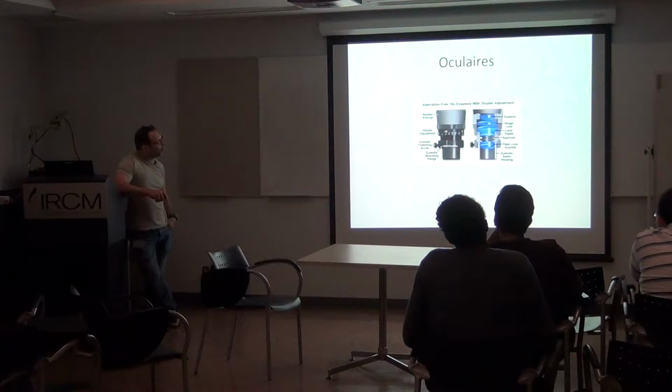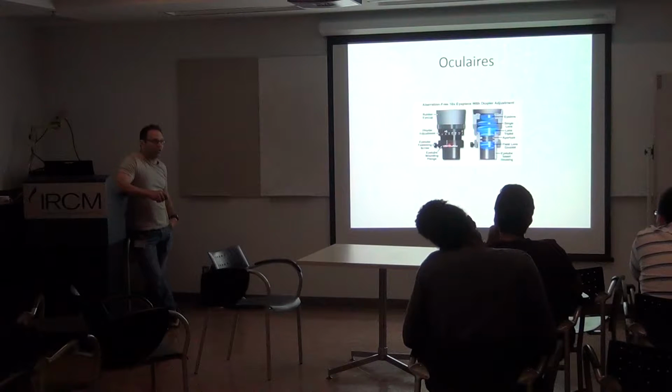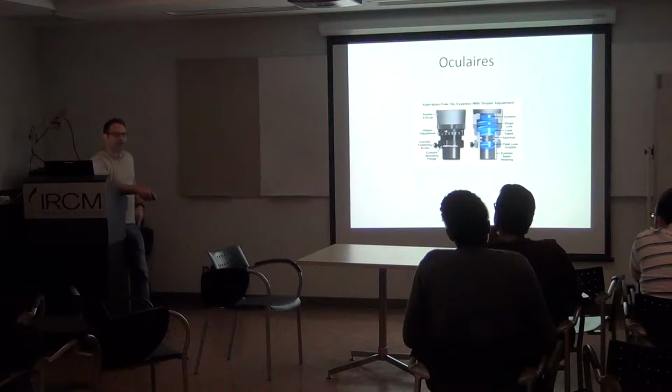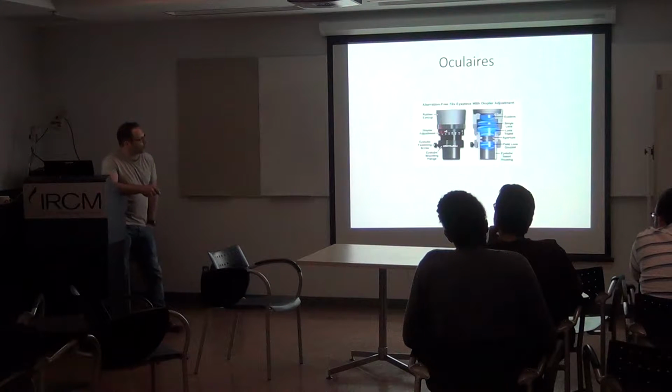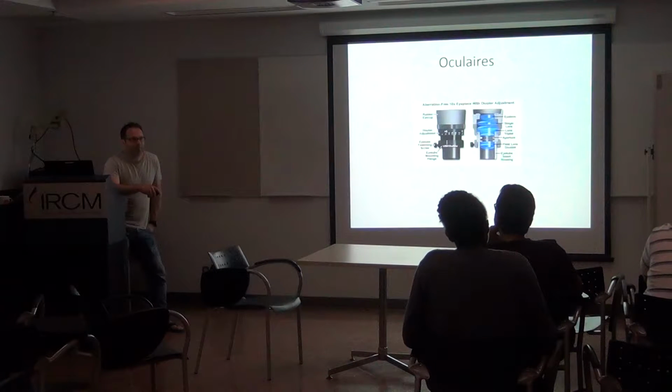The ocular. Usually oculars also give a certain magnification, and most of the time it's 10x that it magnifies your image. So just using the ocular will make your object 10 times bigger.